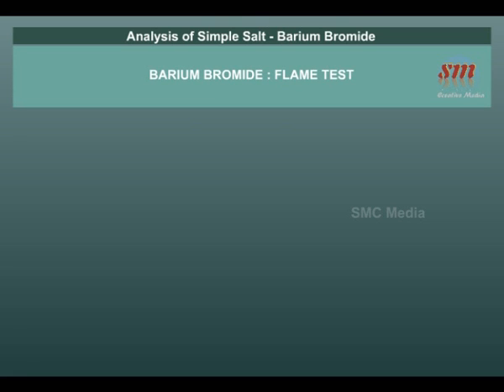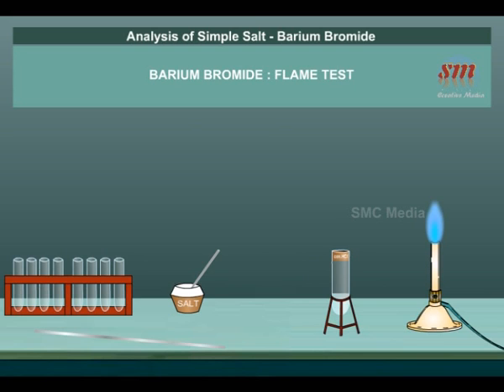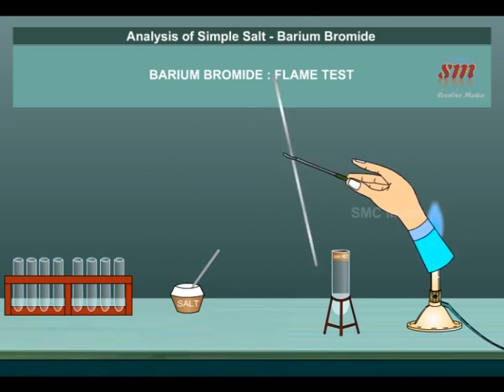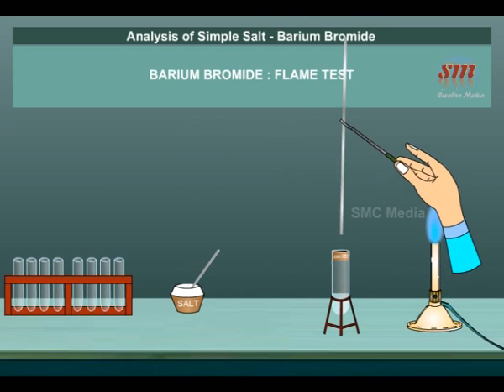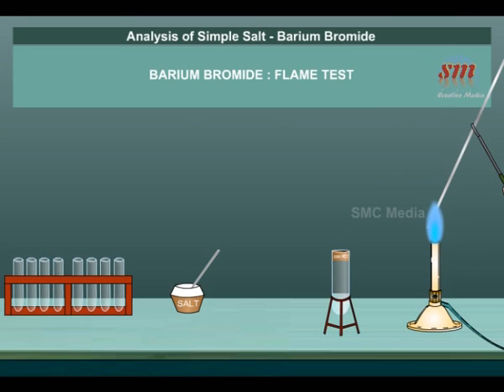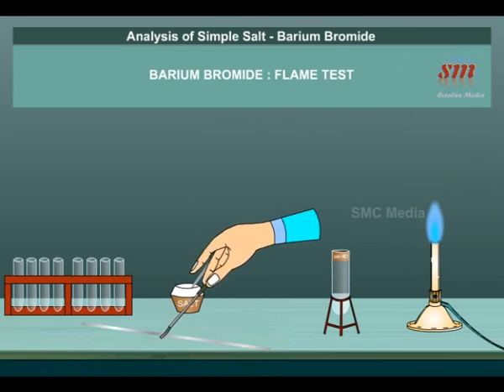Analysis of simple salt: Barium Bromide experiment — Flame Test. Clean the platinum wire by dipping in concentrated HCl and heat it in the flame until no color appears.